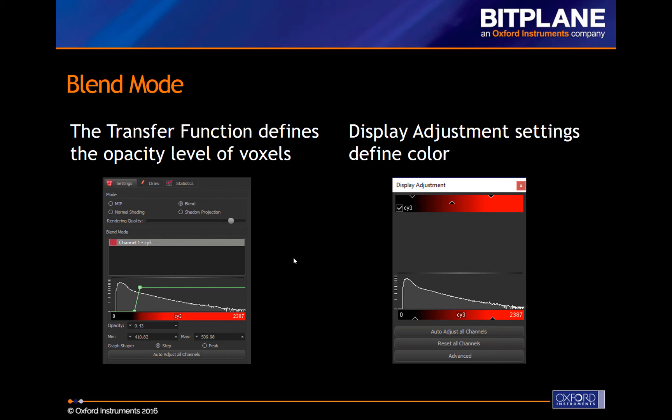Two square control points and a green line define the values of the transfer function in the histogram. You can click and drag all of these. The transfer function defines the opacity of the voxels, and the settings on the Display Adjustment window define the colors assigned to those voxels.